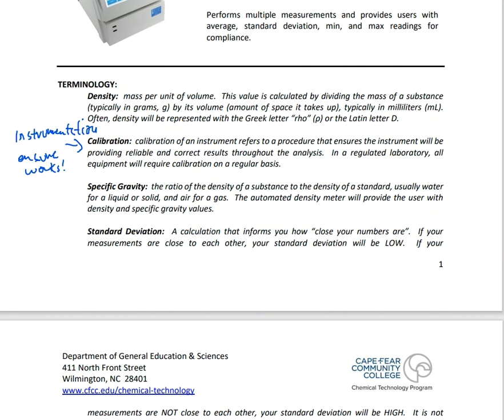So when was the last time that your instrument was calibrated? Can they provide that result? Can they provide that report? If not, then how are you going to prove that the radar was actually reading the correct miles per hour?